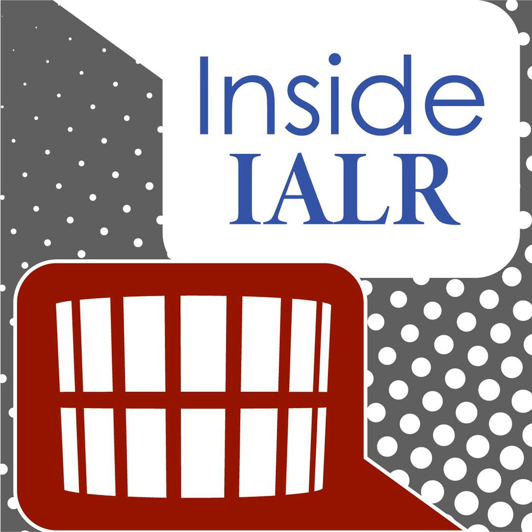So over the years, the control system, how to sort the images into folders for each plant, the graphic user interface, what we call a GUI, that we've created to run the tables, that's straightforward now. It's easy to use.